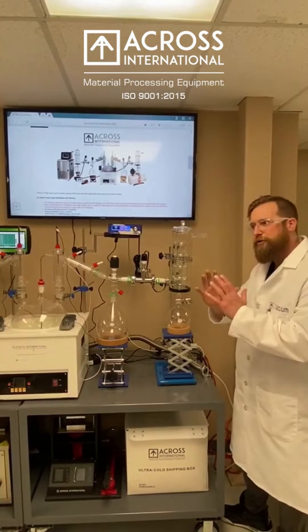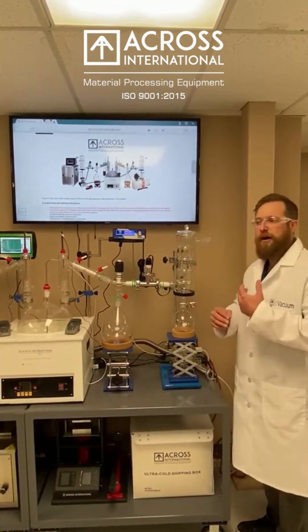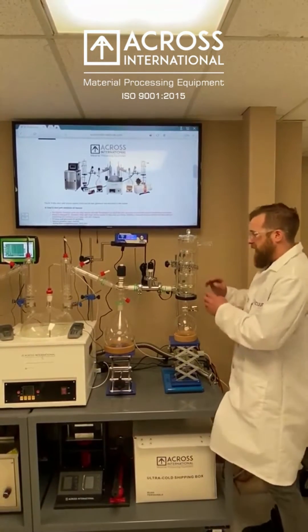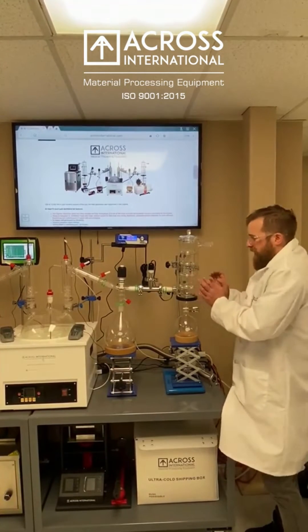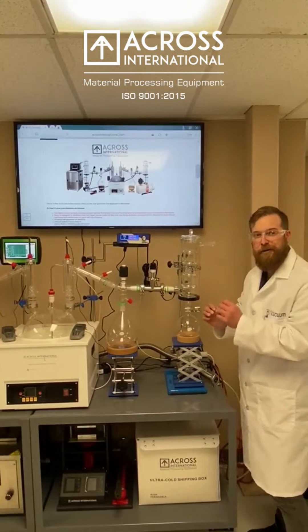No matter which one you choose, you're going to want to go ahead and fill this with ethanol as well. You could use isopropyl alcohol or another form of heat transfer fluid. But essentially, if the dry ice is in here by itself, we're not getting complete coverage to all the glass. We have reduced surface area for cooling.